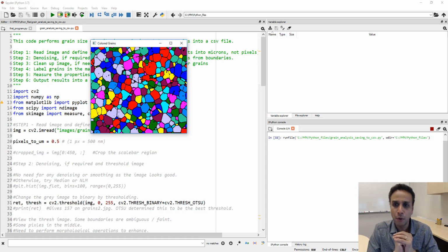If you watch it a bit closely, you can see that there are a whole bunch of grains here that are colored in red, and they're kind of touching each other. The grains here are all in yellow. The grains down here are in some dark purplish color. These are all light blue color touching each other. These ones, again, dark purple to brownish color, all touching each other.